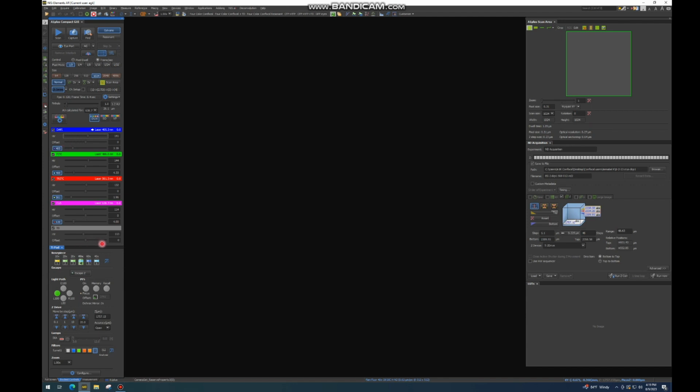Down here, we get into the TI pad. So everything on the TI pad can actually be done physically on the microscope. However, there's some features that people find easier to use on the computer and some features that people find easier to use on the microscope. So one thing that people find easier on the computer is deciding which objective to use. We have 5 objectives, and this 6th position is currently empty. We have a 10x air, a 20x air, a 20x oil, a 40x oil, and a 60x oil.